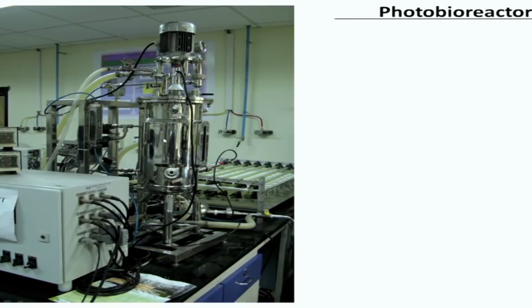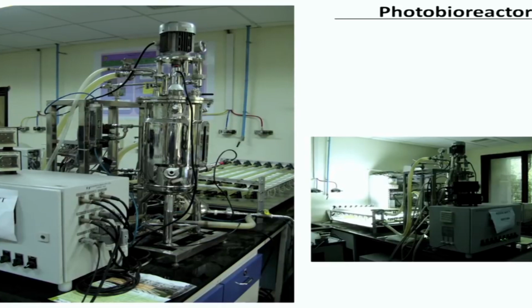The process is rather straightforward and simple. Everything is known about the process. This is the vessel here, which contains the broth, and this vessel has an outlet which leads to the photo section. I think the next picture would show the photo section a little better. This is the photo section lighted up. This is from this angle, and the second photograph is from this angle. I hope you are able to understand that.